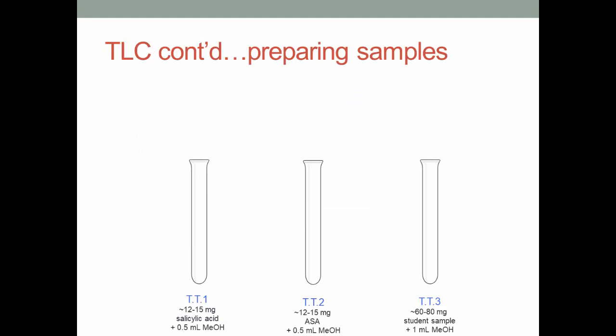We will be preparing three different samples to run on the TLC plate. In the first test tube, put 12-15 mg of salicylic acid. In the second test tube, put 12-15 mg of ASA. And in the third test tube, put 60-80 mg of your sample that you made last week.